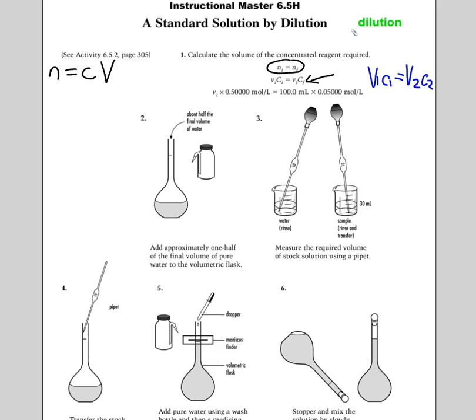And then we take a pipette bulb, and of course what's not shown here is the person is holding onto the pipette bulb. It's not a turkey baster, so we don't jam it on the end of the pipette. It's just gently touched to the top of the pipette, and the water rinse is done. That just cleans out the pipette in case there were any residues from previous usage. Should have been well cleaned, but we rinse it out with water.